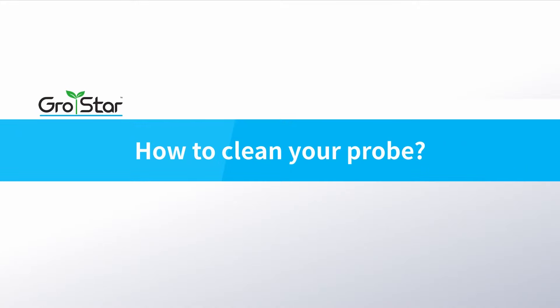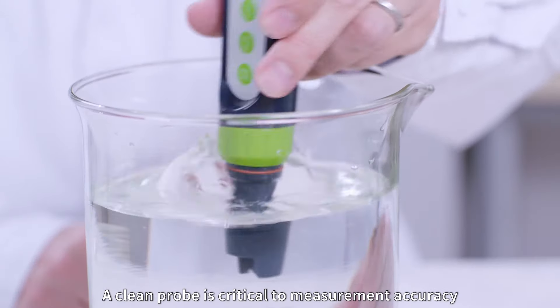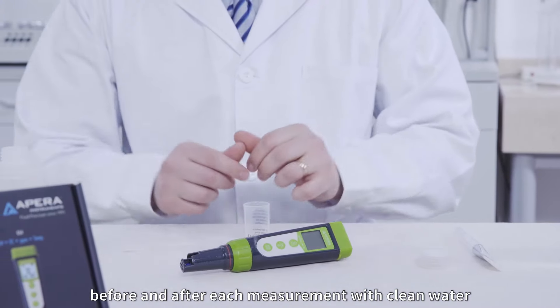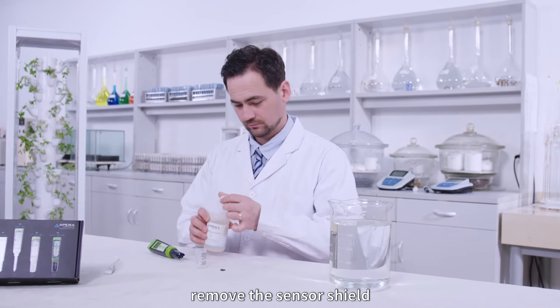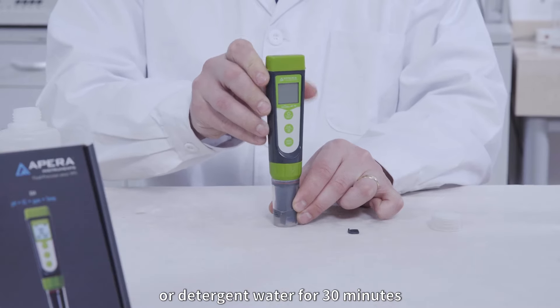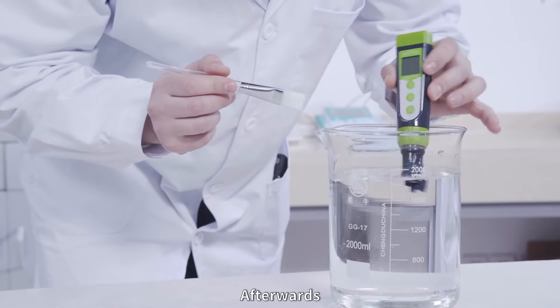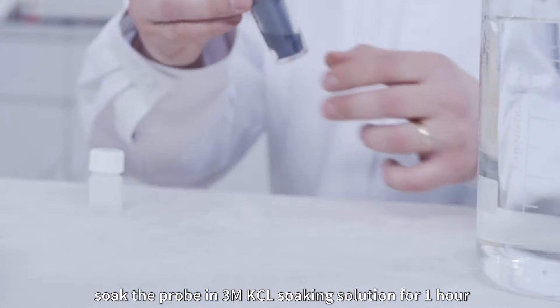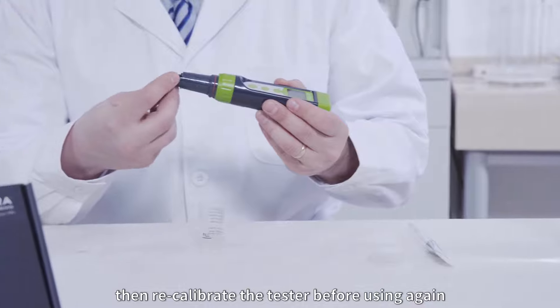How to clean your probe. A clean probe is critical to measurement accuracy. Always thoroughly rinse off the probe before and after each measurement with clean water. For tough contaminants, remove the sensor shield. Soak the probe in a Paris cleaning solution or detergent water for 30 minutes, then use a soft brush to remove the contaminants. Afterwards, soak the probe in 3M KCL soaking solution for 1 hour. Rinse it off, then recalibrate the tester before using again.